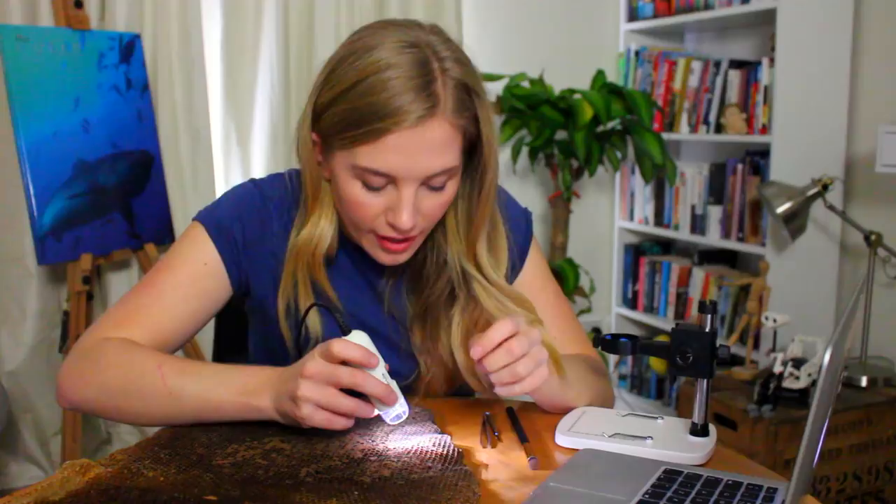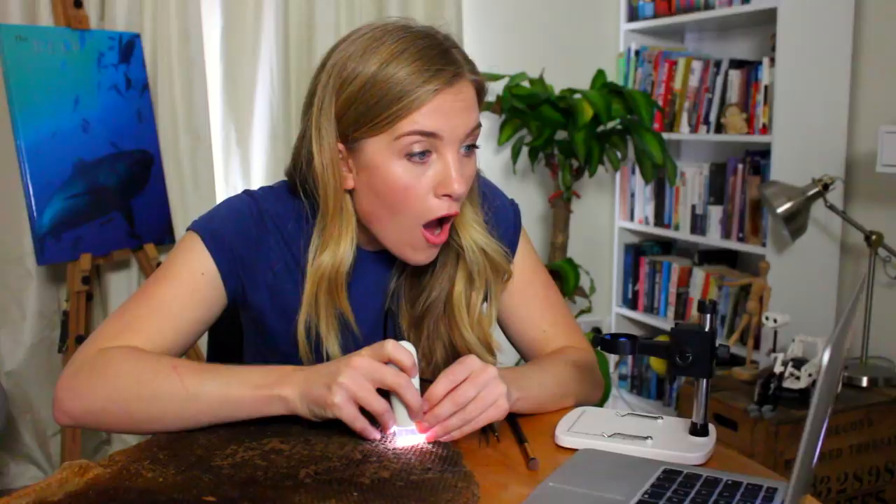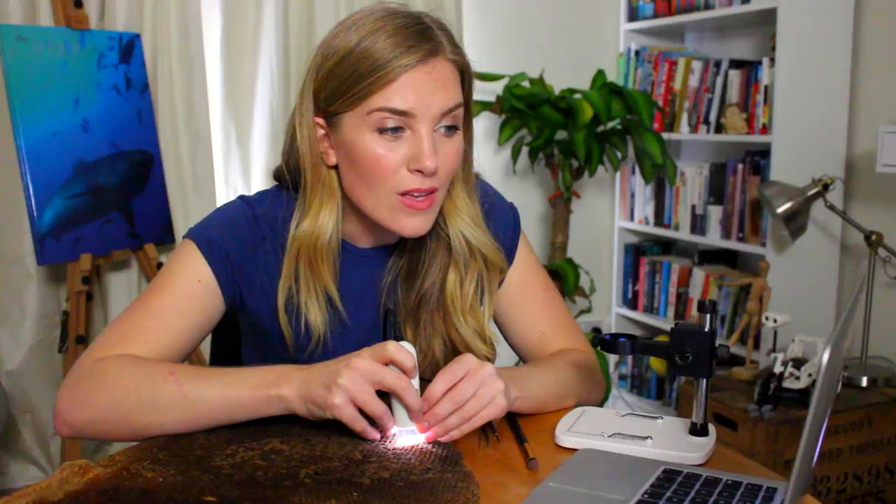Well, I might have found something. I don't know whether this is an egg or some kind of grub from another insect. That's some kind of little grub — a wax moth grub. Having done a bit of research, I'm pretty sure this is the lesser wax moth caterpillar, and probably the reason all the bees left in the first place, because these caterpillars like to tunnel through the wax comb eating it up as they go, until eventually they spin themselves into a cocoon and transform into a wax moth. So I'm going to leave that little guy alone — not an egg, but very cool nonetheless.